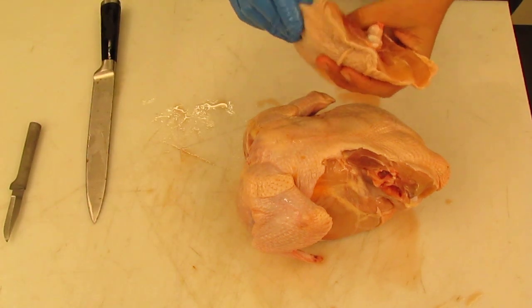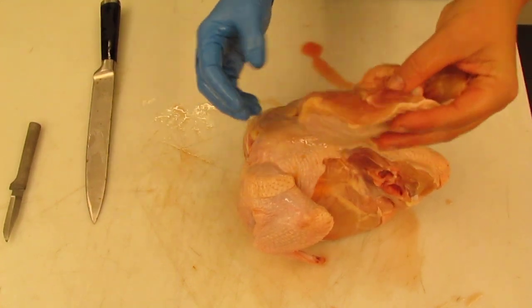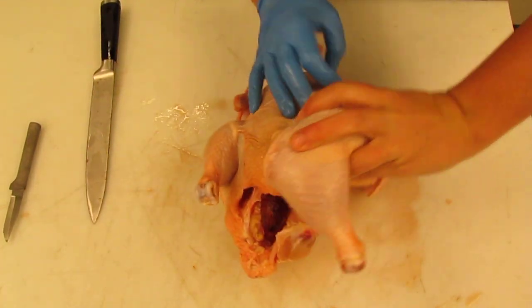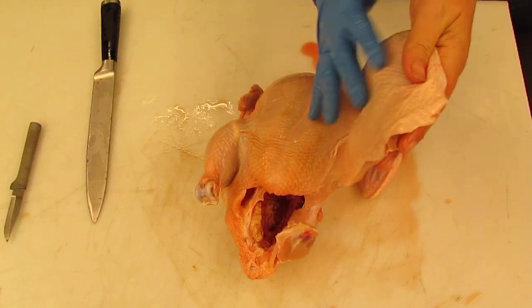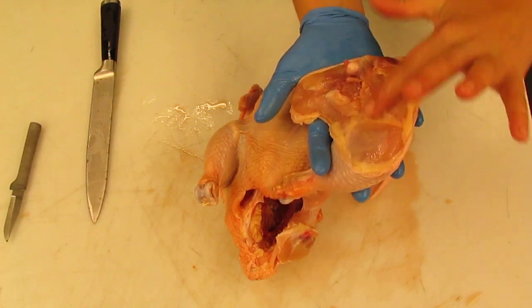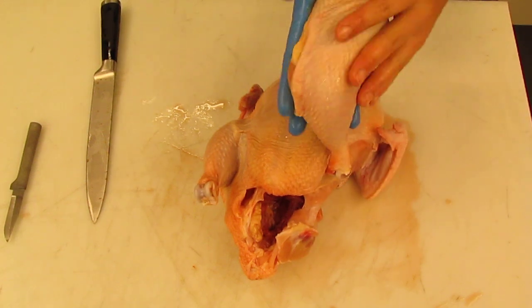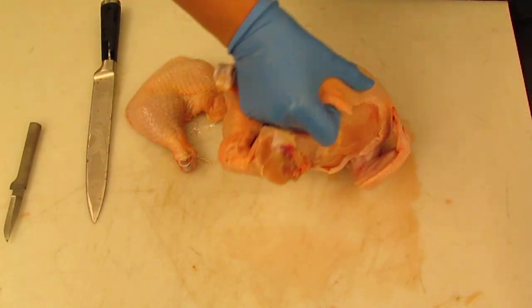Okay, so the first thing that you guys will probably want to figure out is left versus right. Of course, if you have a whole chicken, it's really no big deal because you can simply say, right, if the bird is facing forward, this must therefore be his left leg. If you don't have the whole bird, you should look for the muscle side, right? So here's the muscle, here is the skin, right? So the skin, of course, has to be facing laterally. It's on the outside. You would never have exposed muscle like we see here. So if this is facing medially, we can figure out that this must therefore be on the left side, okay? Any questions so far as I put the bird away?